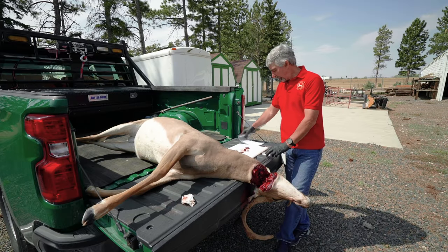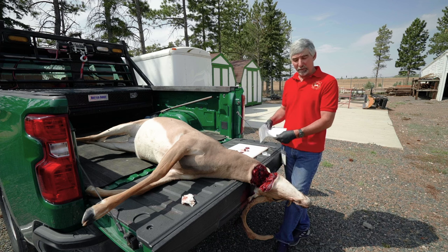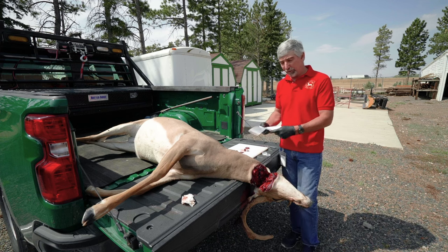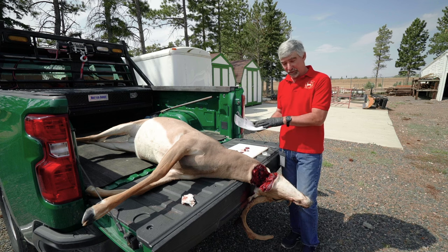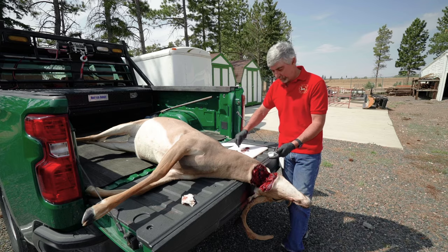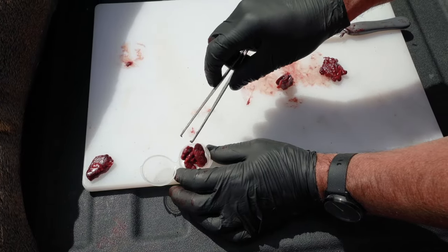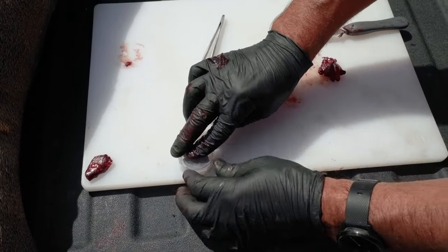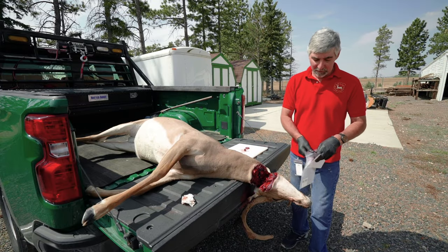So you should have gotten, hopefully, a CWD kit — these are available at regional offices. If not, you can just use a Ziploc bag to put your lymph nodes in until you can get a kit. But once you get a kit, just simply take both those lymph nodes, put them in the cup, close the lid, and put that into the bag.